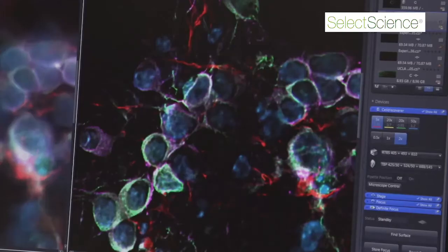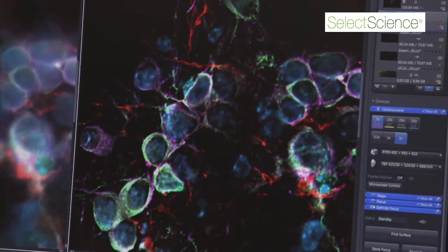It also has a nice camera system, integrated incubation, fully automated sensing of the dish you're loading, optimization of image quality for you, as well as Zen software which is easy to use.